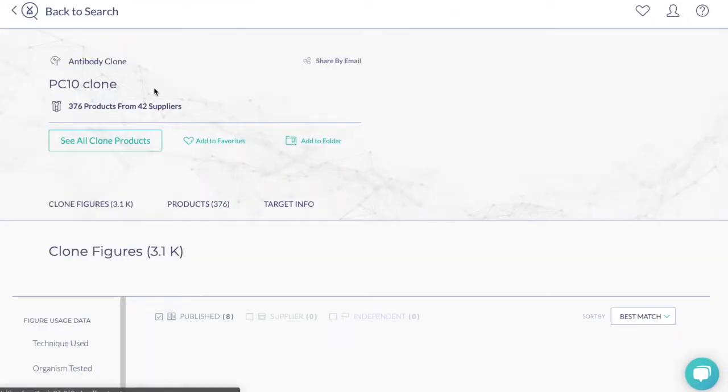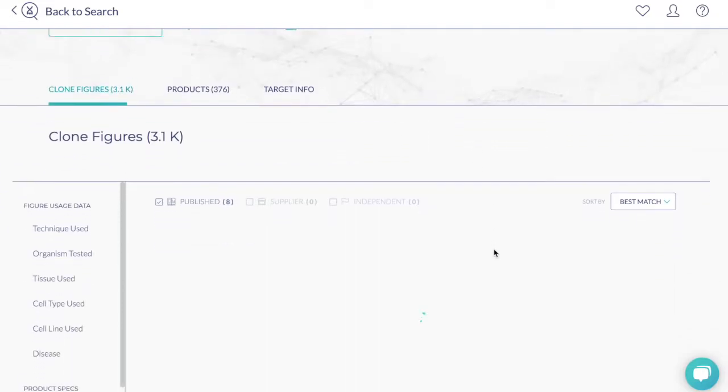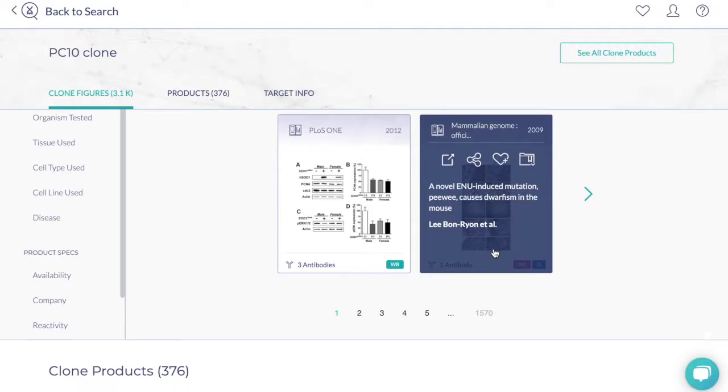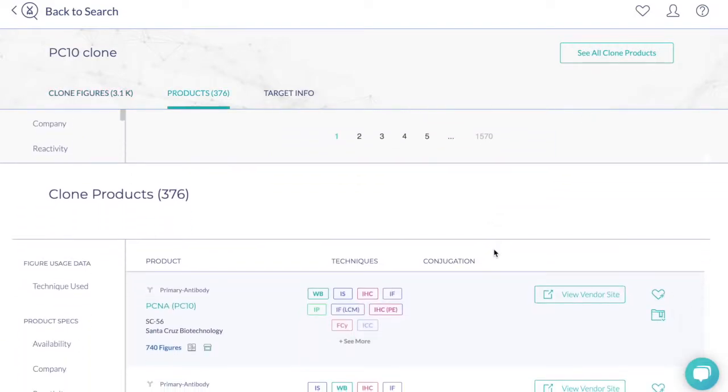Our clone pages include all of the information we've collected and analyzed on the clone, including published figures that cite the clone ID or antibodies that originated from the clone.